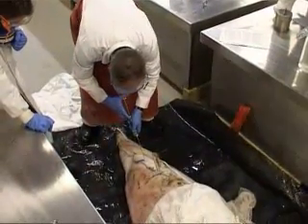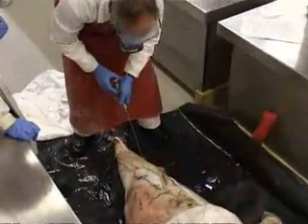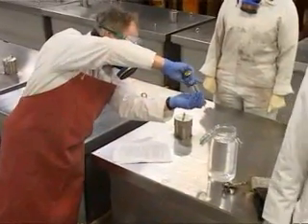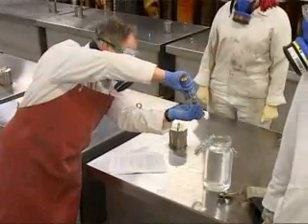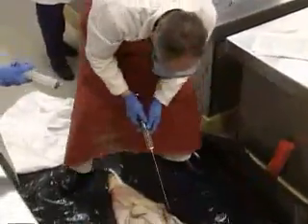The next step was to inject the squid with 10% formal saline solution. This is to get the fixation to the centre of the thick mantle so that the specimen does not begin to rot from the inside out. This is quite a hazardous chemical, and so we're required to wear full safety gear and breathing apparatus.